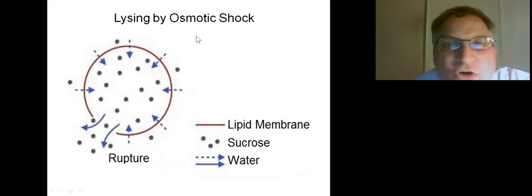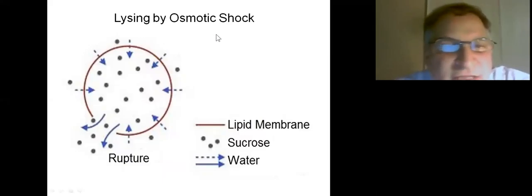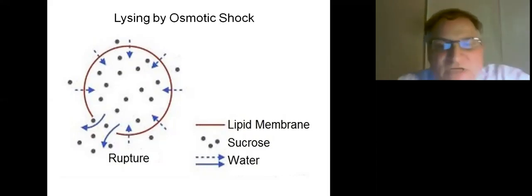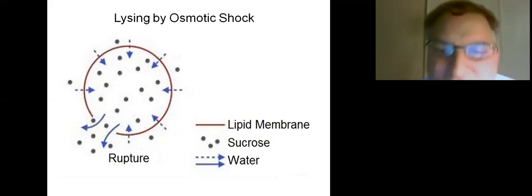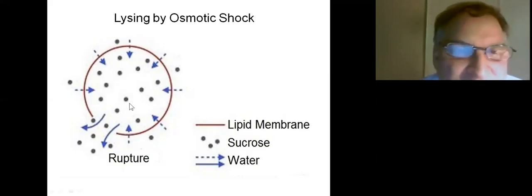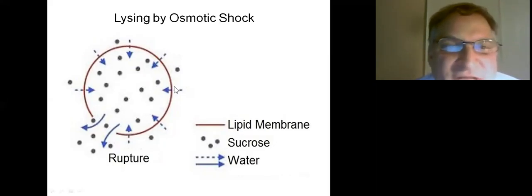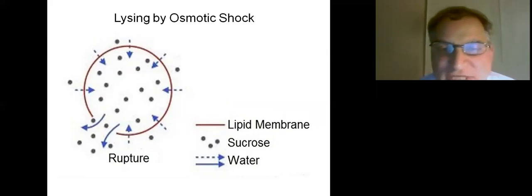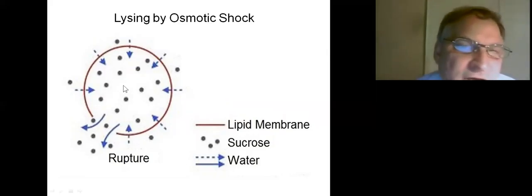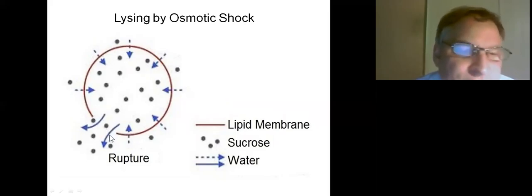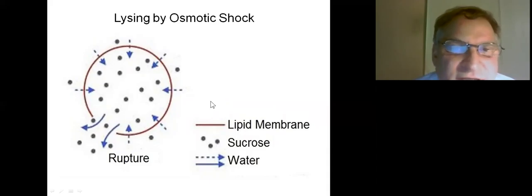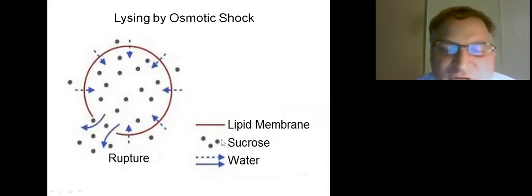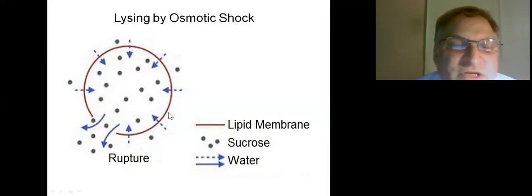For osmotic shock, we spin down the culture, mix the pellet with a sucrose solution so sucrose is absorbed into the cell, spin it down again, then mix the pellet with water. Through osmosis, the water rushes in and bursts the cell, spilling out the Lispro. It doesn't seem to be working well — we've tried chilling the water to make the outer membrane more brittle, but we're still having problems.